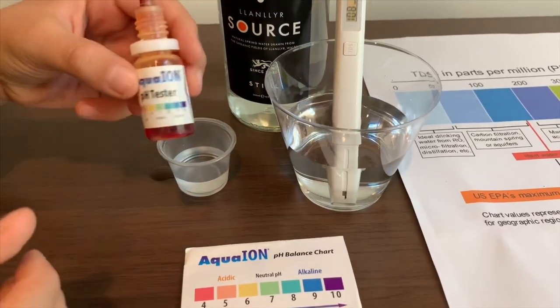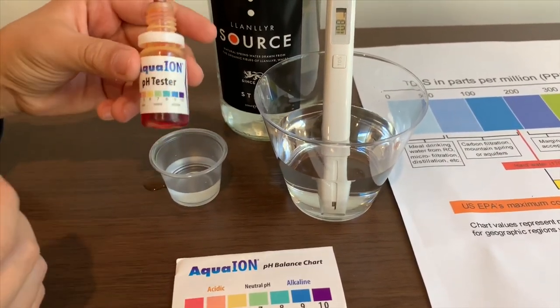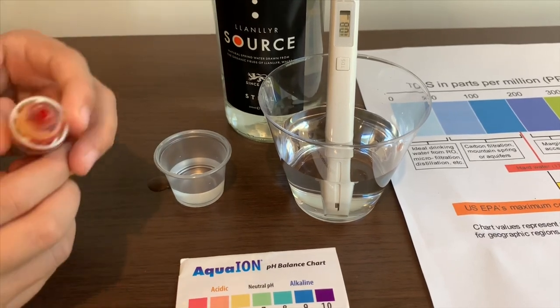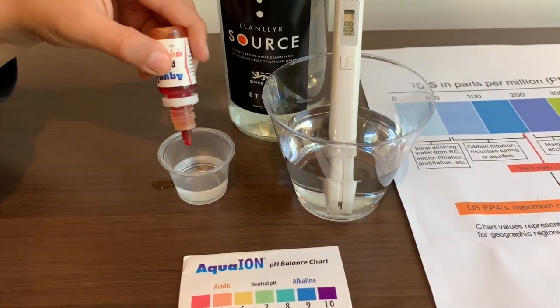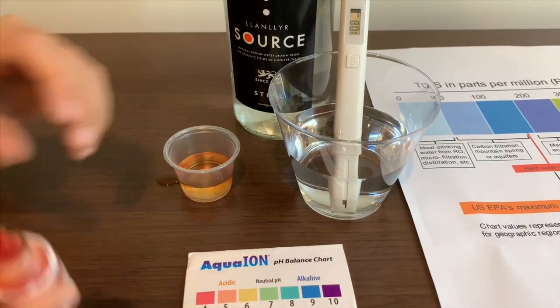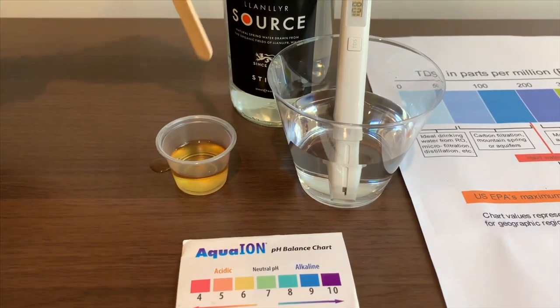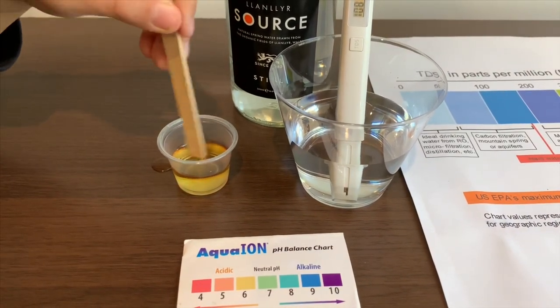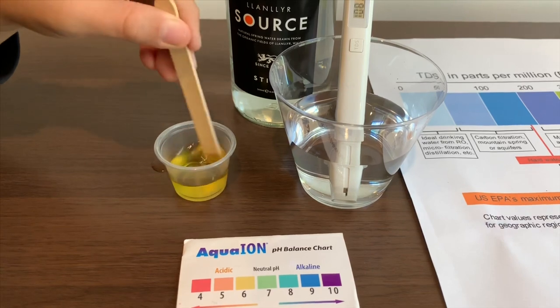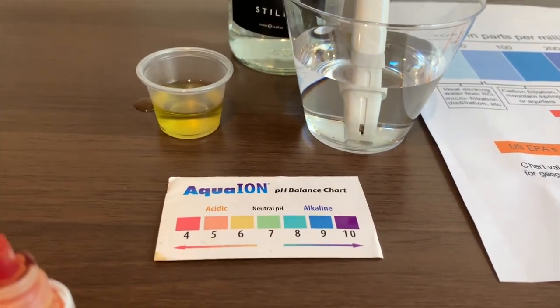Now let's test the pH level. If you want to buy this pH tester, check the link down below. I'm going to do two drops. Let's stir it with a stick so we'll get a better result. I give this a 7. This is a neutral pH.